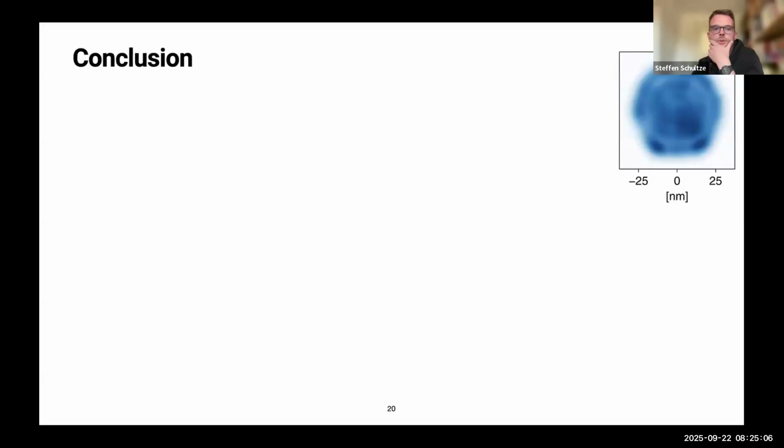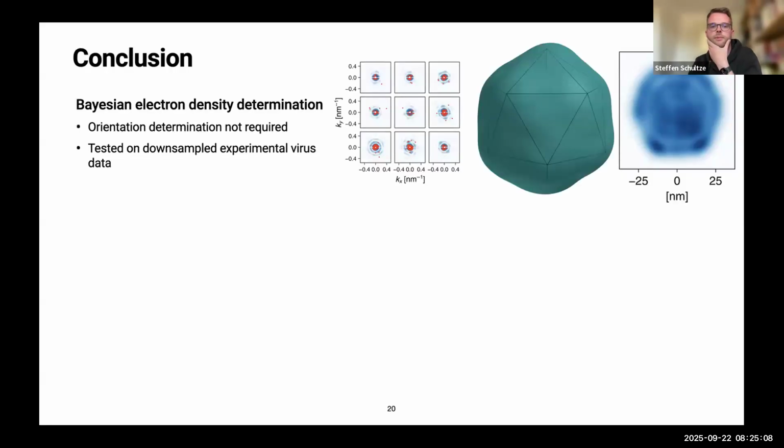Yeah, so I actually already want to conclude here. We have seen our Bayesian electron density determination method, which circumvents the need for orientation determination. What I have not shown so far is that we have tested this on experimental data, not on proteins, because to our knowledge we don't have access to actual single protein data.